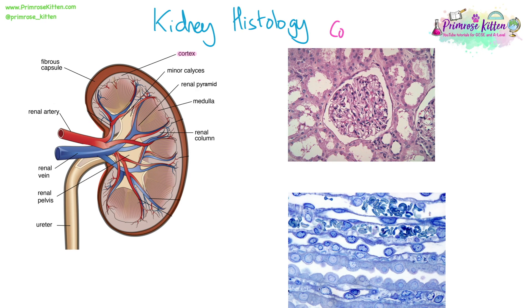In kidney histology, you need to recognize both the cortex and the medulla and structures inside them under the microscope. Let's start with the cortex — this is clearly the cortex because it contains a glomerulus, which is that bundle of capillaries visible in the center. Then you've got this white space around it, which is the Bowman's capsule.